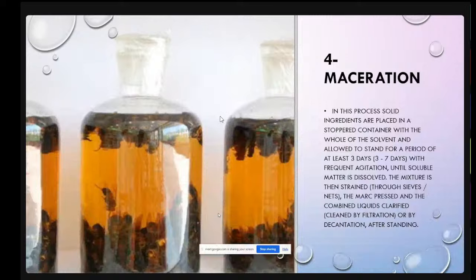Another type is maceration. Maceration is the process where the solid ingredients are placed in a stoppered container with the whole of the solvent and allowed to stand for a period of at least 3 days, maybe 3 to 7 days, mainly at room temperature without heating or cooling.